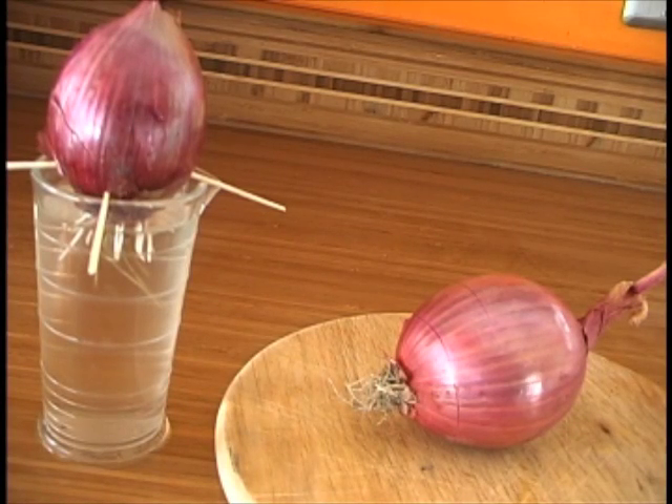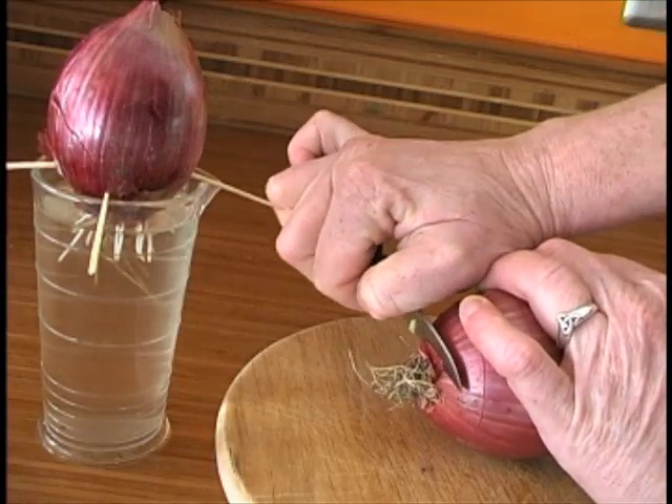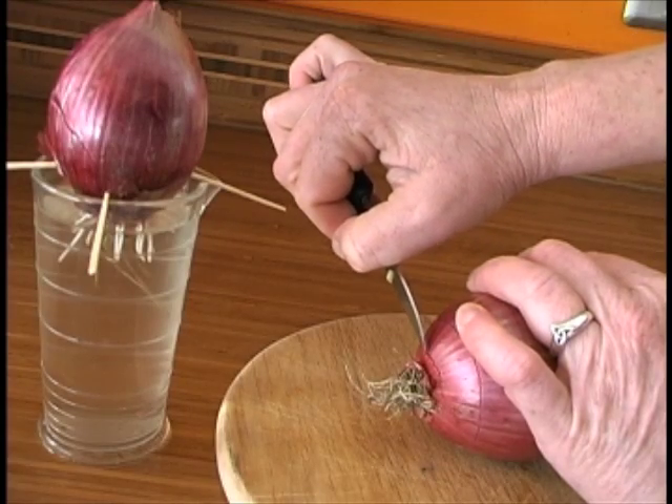Here's how to prepare your onion for the mitosis lab. You want to make a small cut right here above the roots. You don't have to cut off the roots — you just want to make a small cut to open up some fresh tissue.